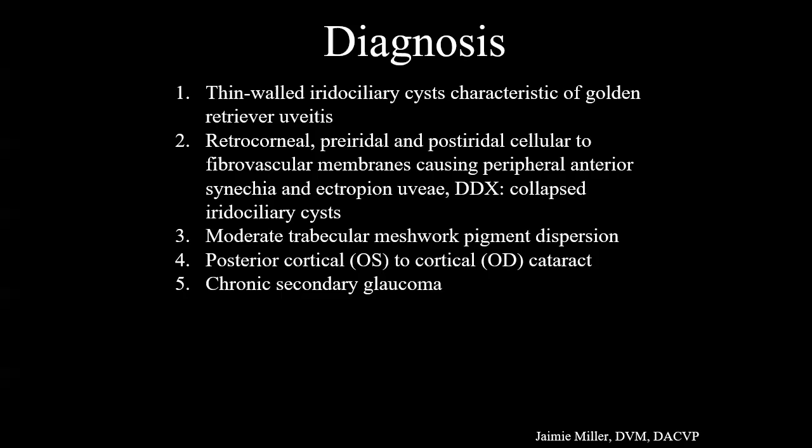Because these golden retrievers, and we've seen similar lesions in other breeds also, will eventually develop glaucoma and have to be enucleated. It's most commonly a bilateral disease, especially in golden retriever dogs. So if we only get one eye, we're obviously warning the clinician. Most of them know, but just to keep an eye on the other eye, it's likely going to develop glaucoma since it's likely having the same process going on.